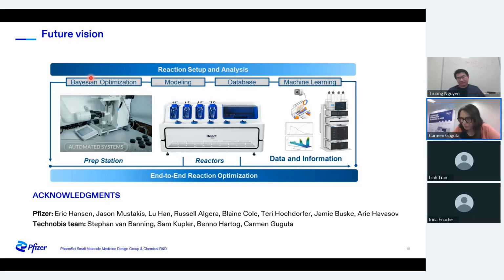It is more from a qualitative point of view, to see whether I have oiling out or precipitation. Although we have already done tests with different magnification cameras, using the technology from our crystallization systems, where in principle you could also determine particle size with the ReactALL. I don't know if any of your ReactALLs have different magnification cameras, or just one. I'm not very sure.